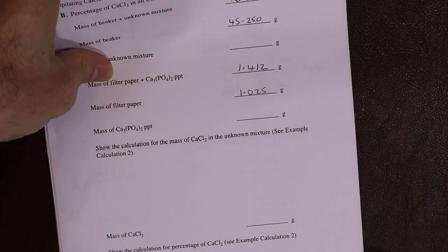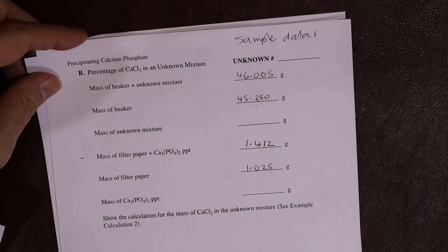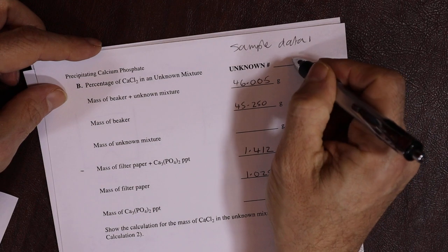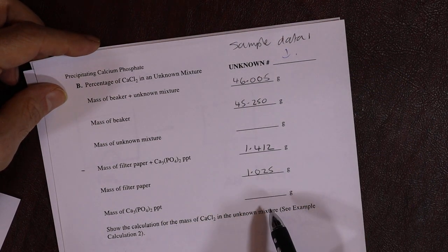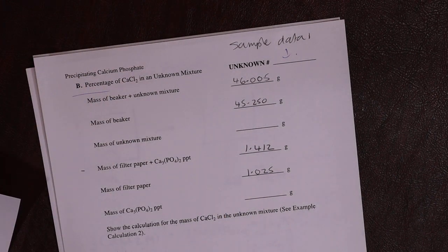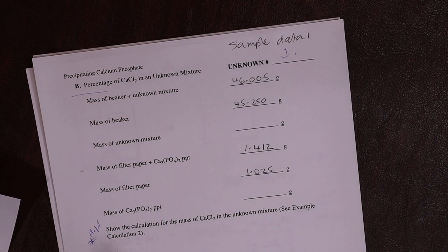When we did unknown, we'll just call it unknown sample data 1, you got the same kind of thing here, but this was for B. It was exactly the same procedure, but we just do the math differently. So this is going to be different, and this is going to be different down here.